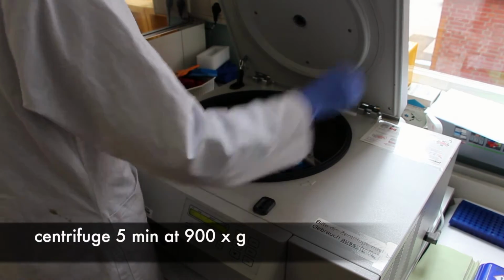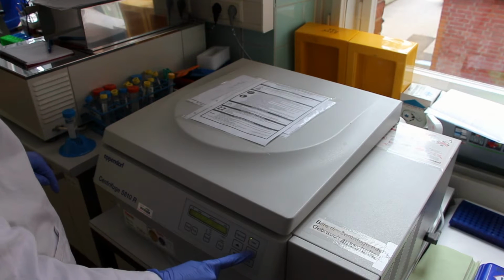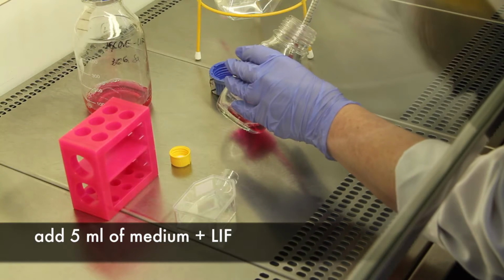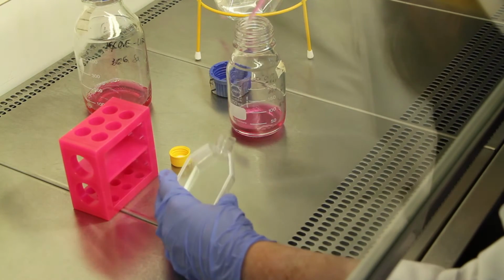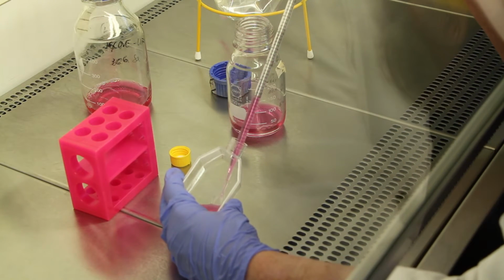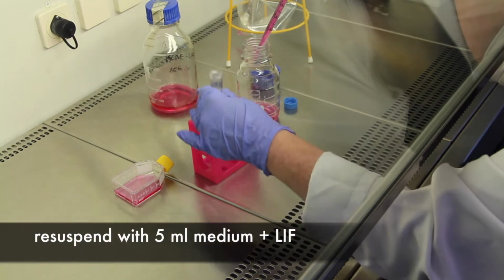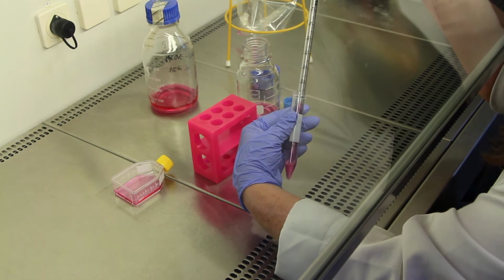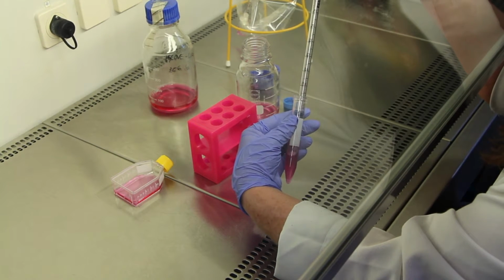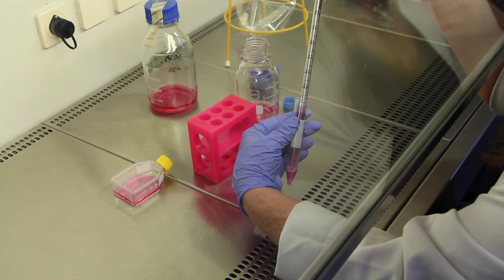The tube is centrifuged for 5 minutes at 900 G. Meanwhile, a culture flask with 5 ml is filled with LIF supplemented culture medium. LIF stands for leukemia inhibitory factor. It prevents the differentiation of the cells at this time. The supernatant containing the freezing medium is discarded and the cell pellet is resuspended with additional 5 ml of culture medium with LIF and is also transferred into the culture flask.